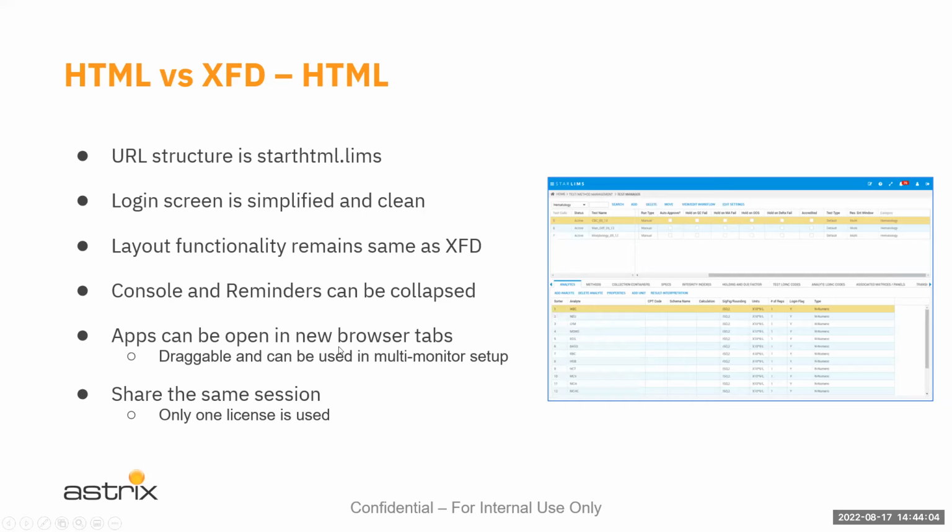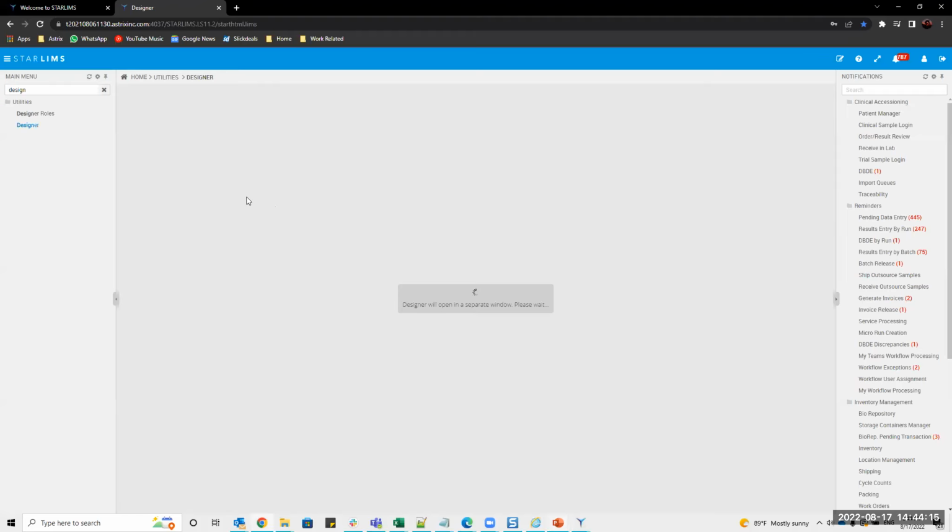Apps can be opened in new browser tabs. This is another main change here. Draggable. And then share the same session. Only one license is used. Okay, so we go back to STARLIMS.